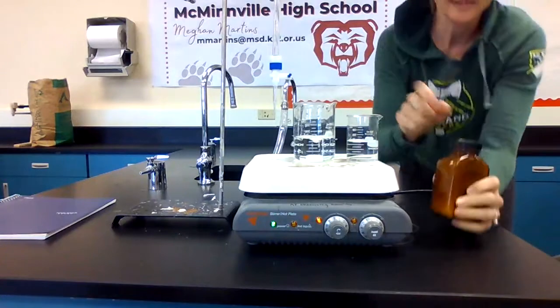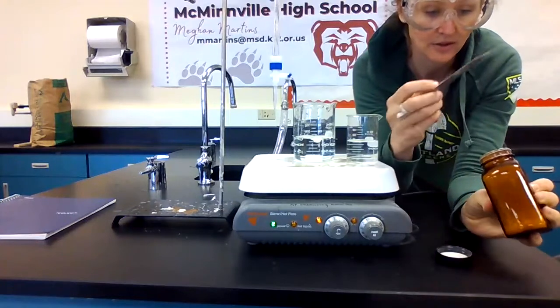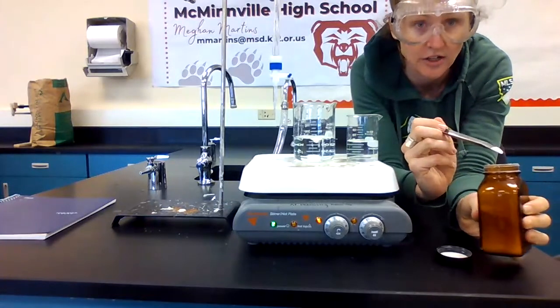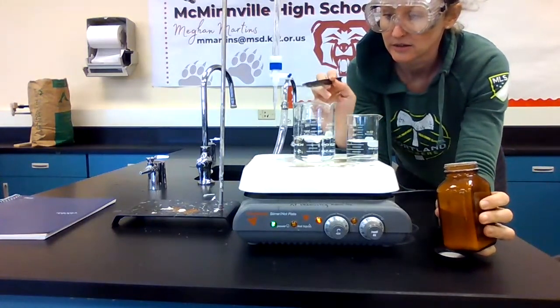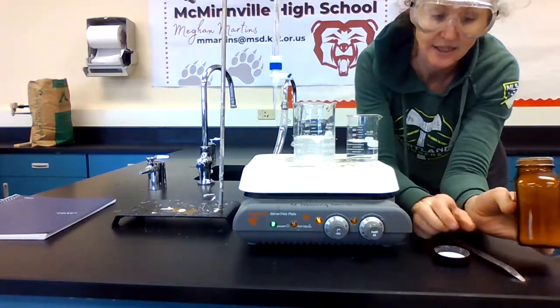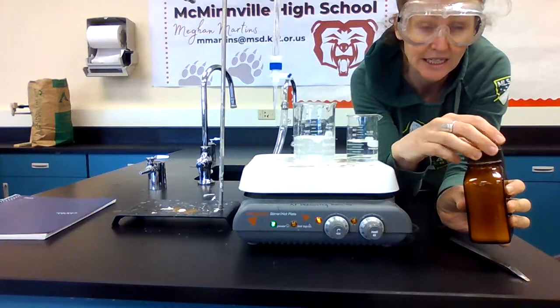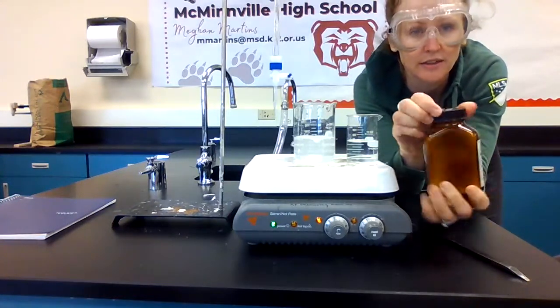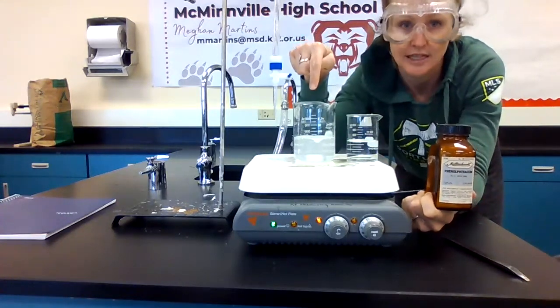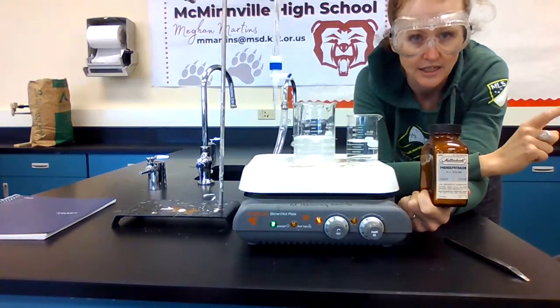So, what makes something an indicator? An indicator is a compound that has two forms. One of the forms has an additional hydrogen ion attached. We call that the acidic form. Another form has the hydrogen detached. We call that a basic form. In order to be an indicator, these two forms need to be different colors. The acidic form of phenolphthalein, you can see right now, is clear. The basic form is going to be pink.